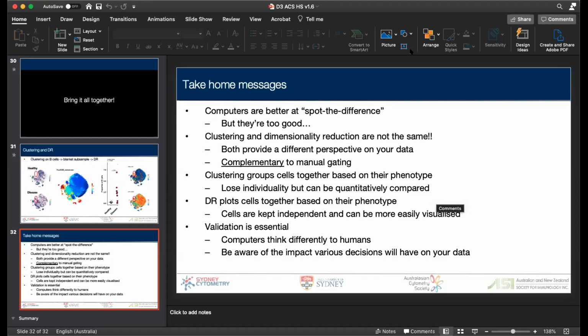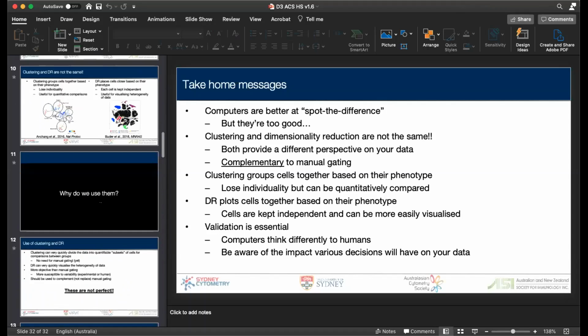But I think that's an issue that, at the moment, I don't think there's a solid answer for. Alternatively, if the interest is in finding rare cell populations, what we often do is purposely get the algorithm to overcluster. So for instance, if you're expecting probably 8 populations in general, but one of the populations is very, very small, what I would do is get something like FlowSOM to generate, say, 16 clusters. What that inherently does is allow it to divide the major population into smaller groups, but at the same time also allows it to find the smaller subset, if that makes sense.